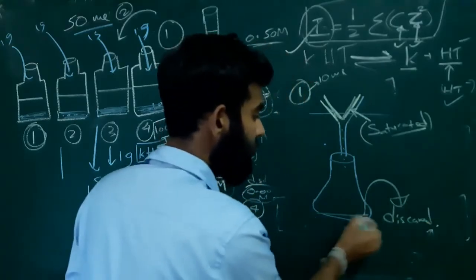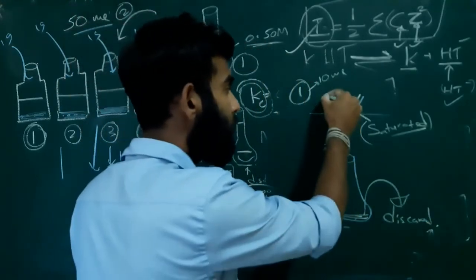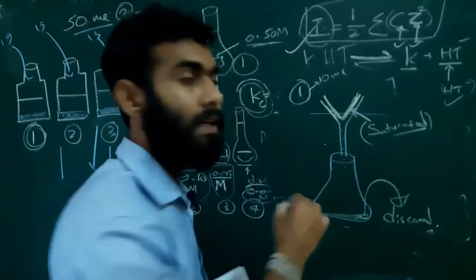Because the concentration is now different, since some amount of water is absorbed into the filter paper.